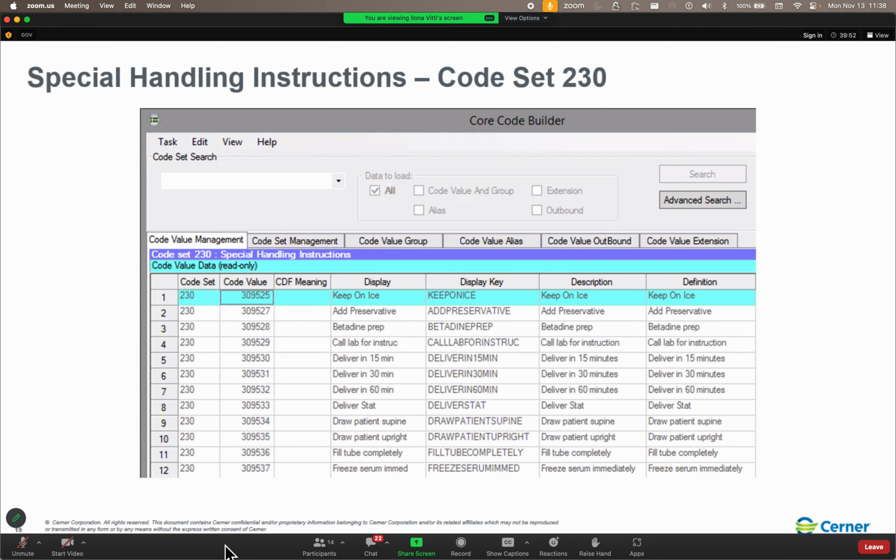Now, if we're not creating a micro, we can still use the add collection parameters to build an accession class. That's fine. And again, it will be automatically assigned the Julian dated format. Because, again, for everybody who's not anatomic pathology, we recommend the Julian dated format.